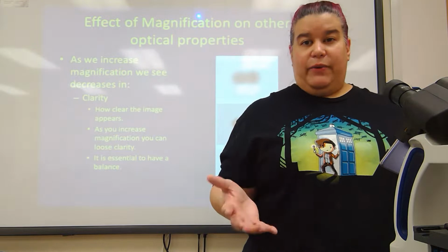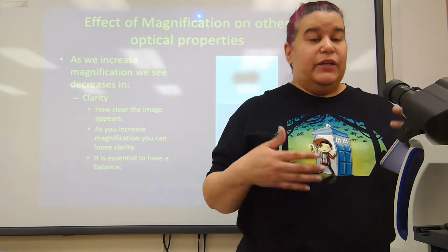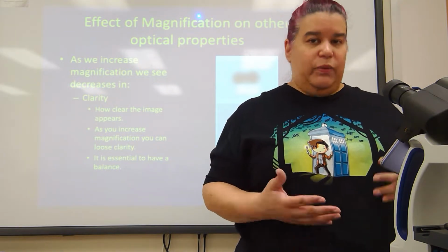Clarity is kind of like resolution. We want to have a clear image that appears. You can increase magnification all you want, but if there's no clarity, you can't see your sample, which isn't helpful.